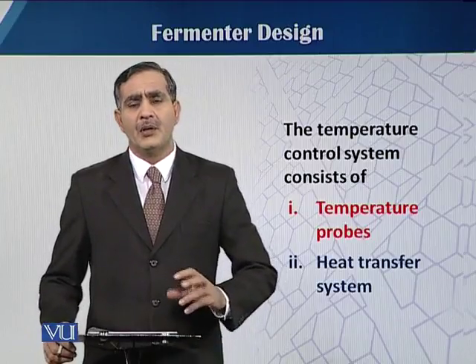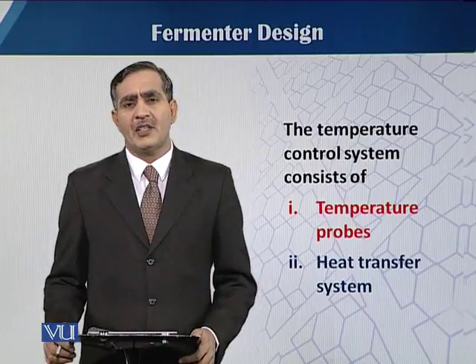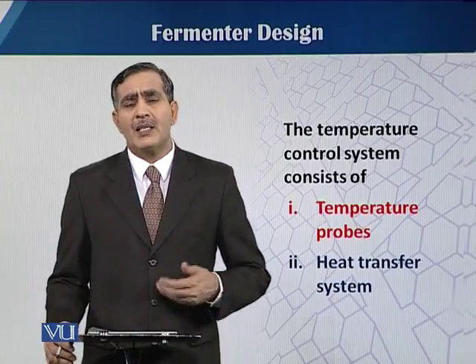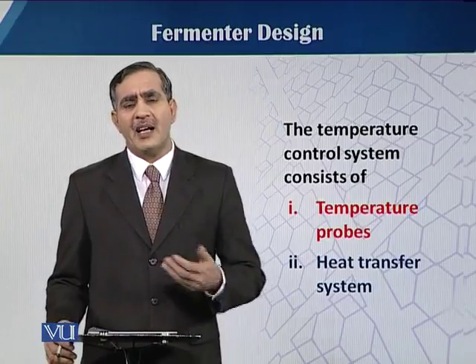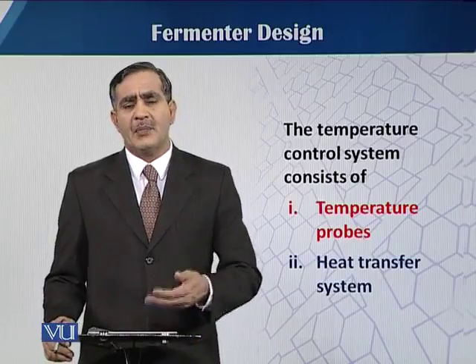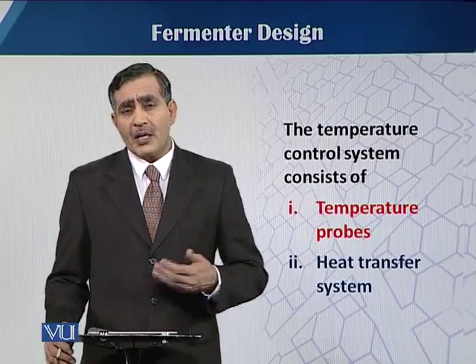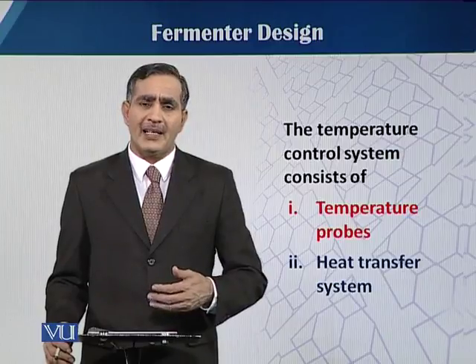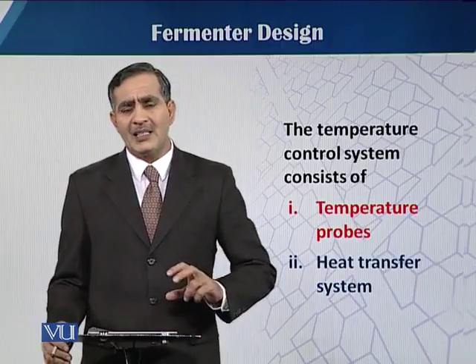that actually controls the temperature of the fermentation vessel or the fermentation medium. We know what temperature is. Temperature is actually the average kinetic energy that exists in any system. So that is basically a type of energy. Before controlling the temperature, we should know what factors can lead to a change in the temperature.